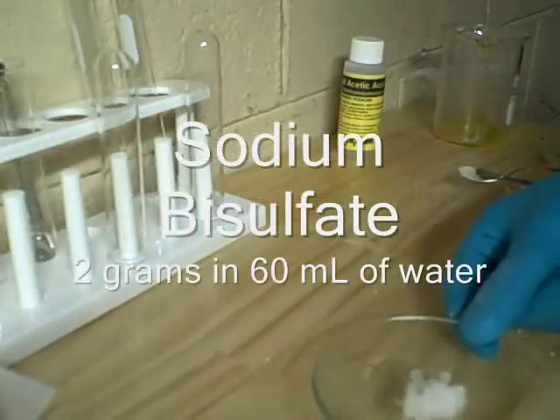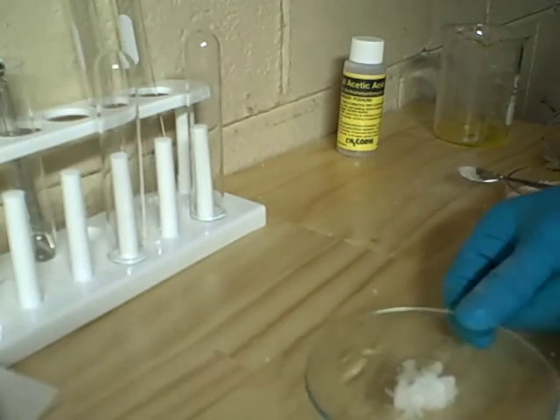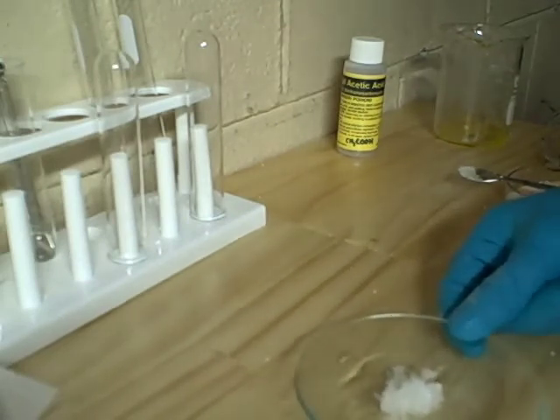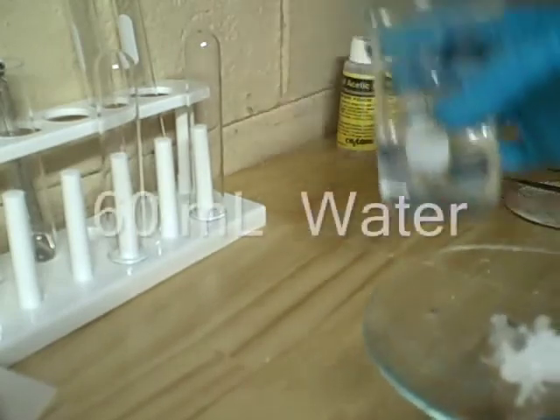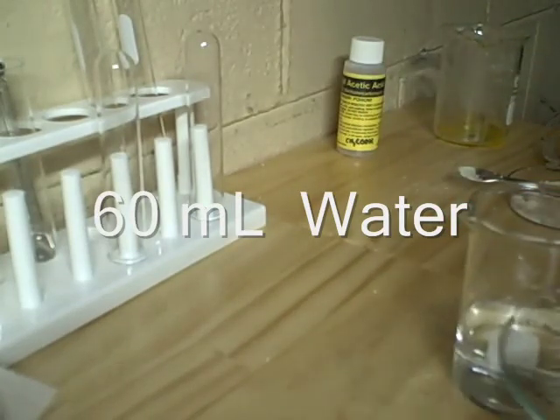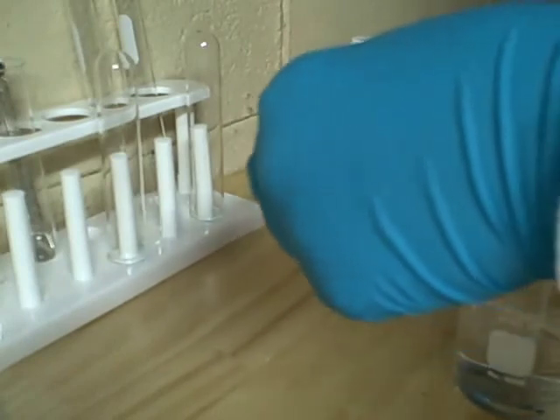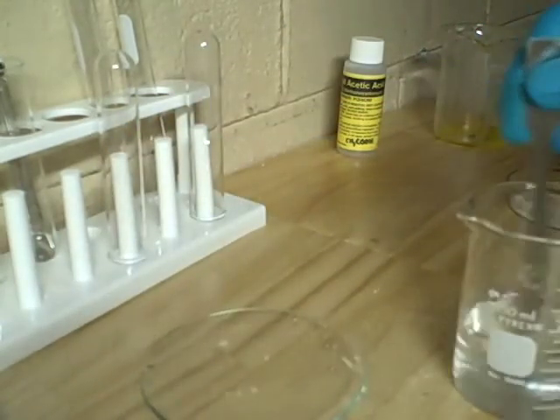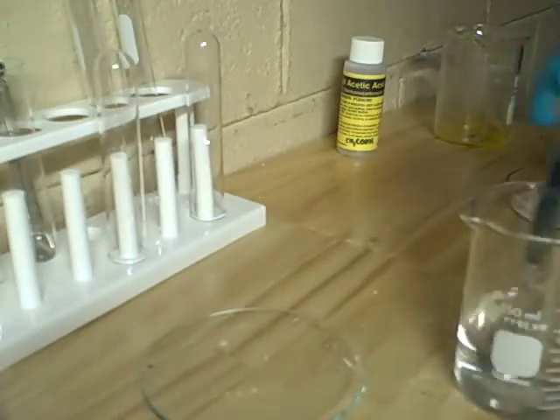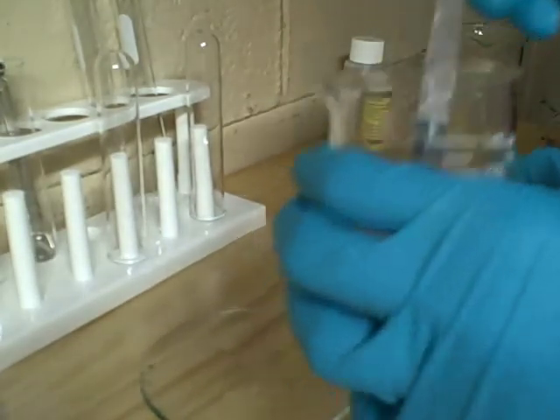I just weighed out an equal amount of sodium bisulfate — this is two grams. The place to obtain sodium bisulfate is Thames and Cosmos; most of their kits have this. You can also go to the pool supply store; they sell it as pH down. Right here I have about 16 milliliters of water and I am going to add the sodium bisulfate. In it goes. Here's our sodium bisulfate solution — let's stir it until it's all dissolved.